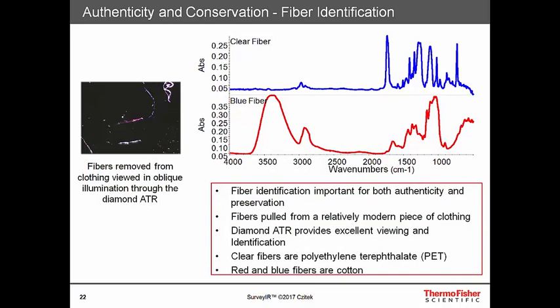We can also readily identify fibers using Surveyor. In the image on the left, we see several fibers in the field of view observed under oblique illumination with the diamond ATR. By touching the fibers, we can selectively measure their spectra. The blue spectrum is from a clear fiber with a very regular shape and habit, identified as polyethylene terephthalate or PET. We also measured a blue fiber — in the field of view you can see a blue fiber and a red fiber, which were actually the same material, cotton. Cotton is primarily cellulose and is a natural fiber, and the infrared absorption spectra of the synthetic versus natural fiber are very different and can be differentiated readily.